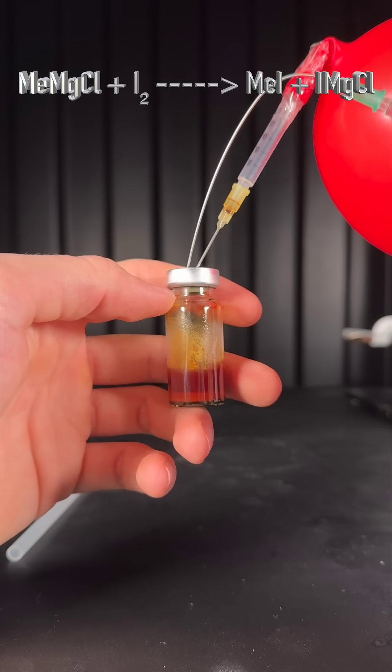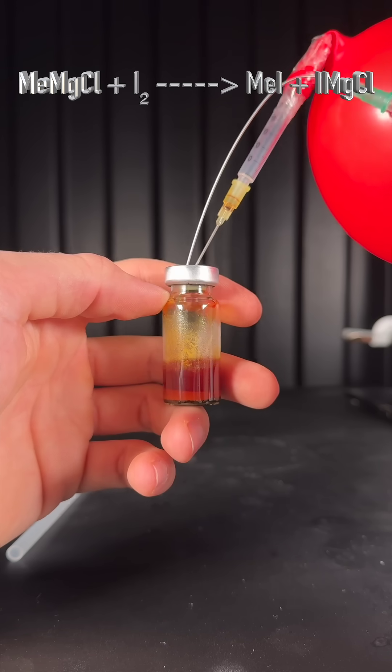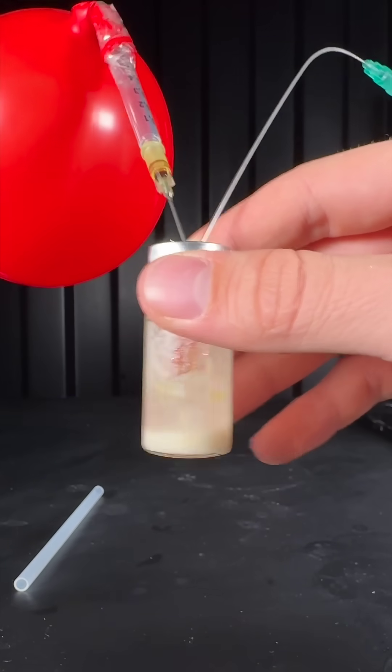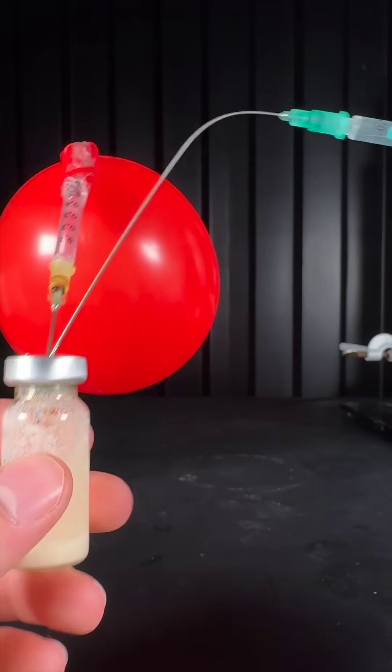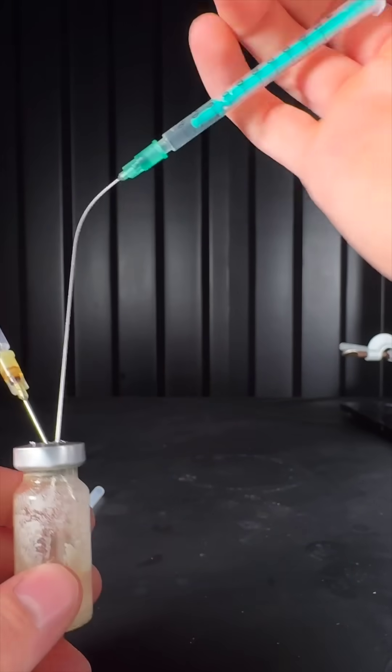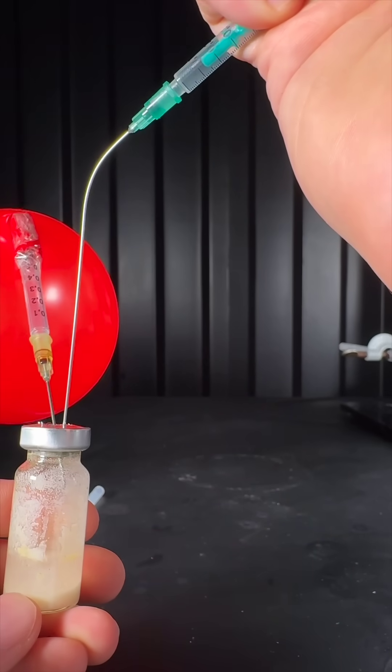I added Grignard reagent dropwise and shook the vial in between. When the color of iodine disappears, the reaction is finished. I used 0.68 ml of Grignard and that's close enough to the 0.66 ml I calculated.